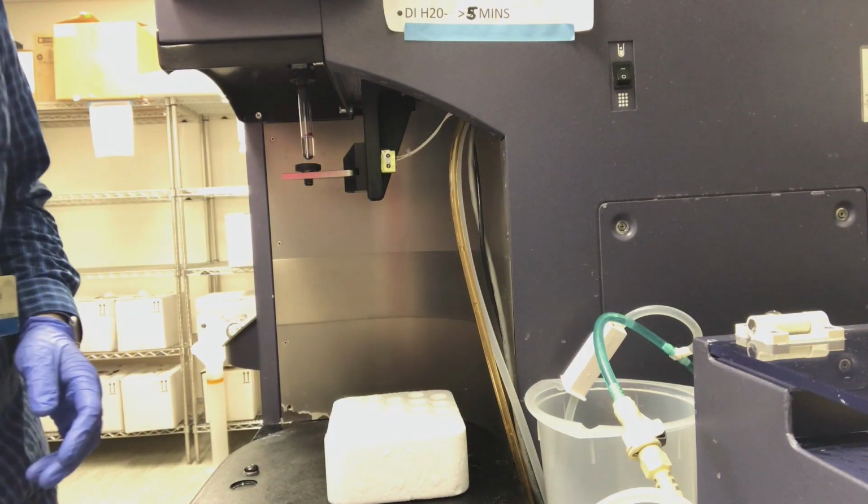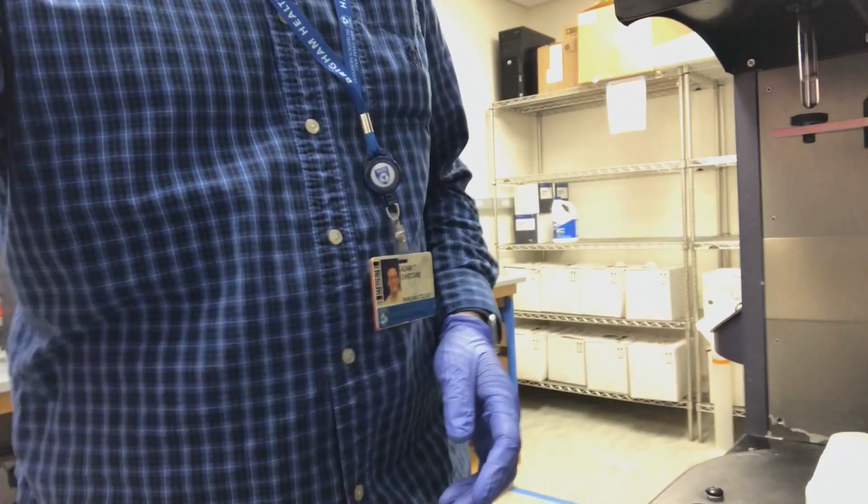Many issues with electronics, as we all know, can be remedied by turning it off and turning it back on. Please shut down the computer fully, not a restart. Power off the cytometer, and then start back with the computer on first, log into Windows using the computer login info that we discussed before and is posted on the monitor.